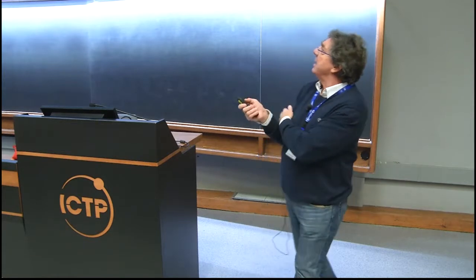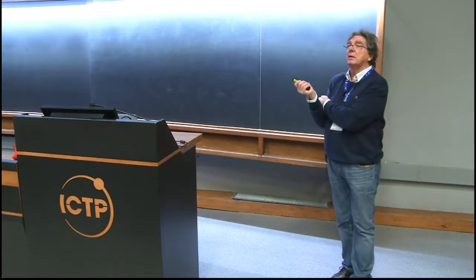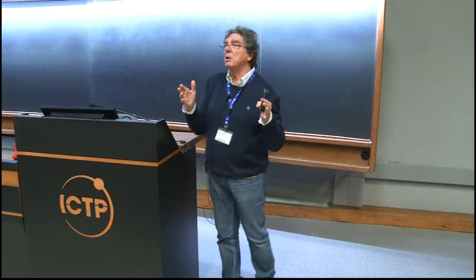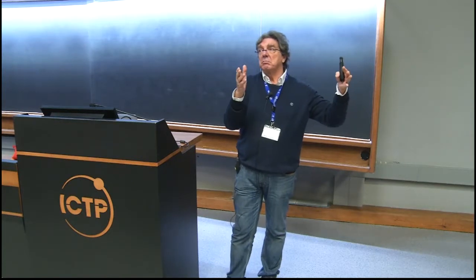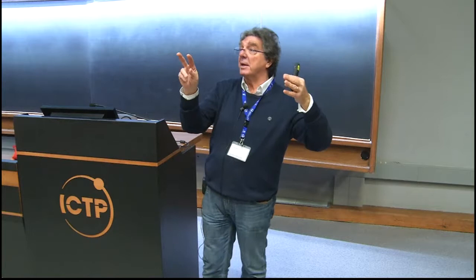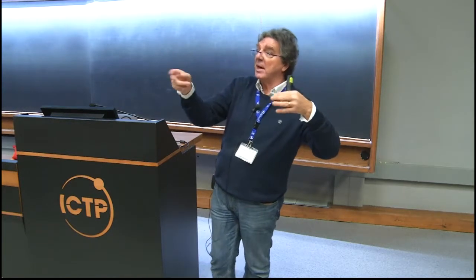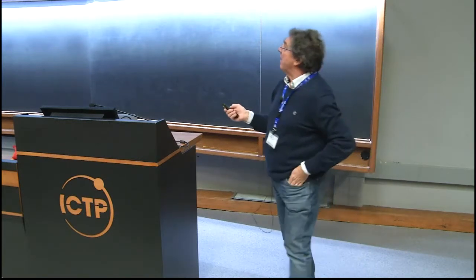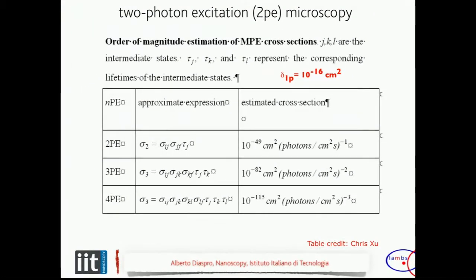And if you measure the cross-section under two-photon excitation, you find a different behavior from the case of the single-photon excitation. It is like a dice: you have more probabilities of making 10 with 5 plus 5, 3 plus 7, whatever you want. And the behavior you have can be very useful. But first, let's have another comment about this cross-section. It cannot be predicted for a certain molecule, but you can have a numerical estimate.